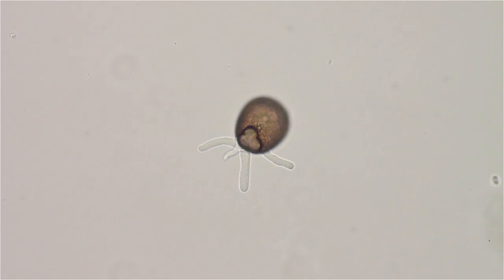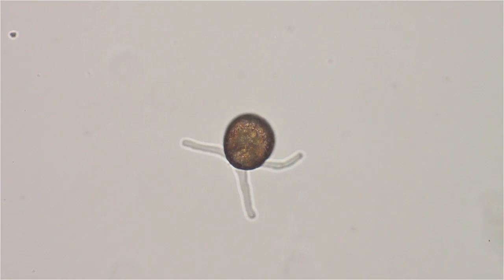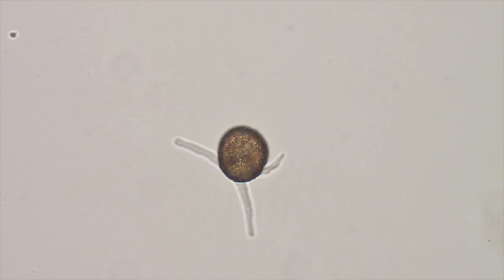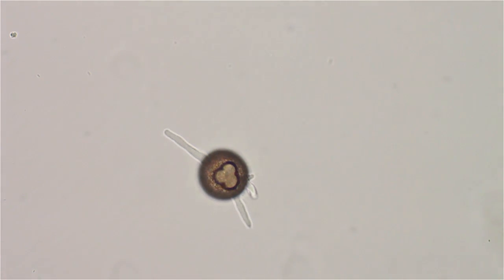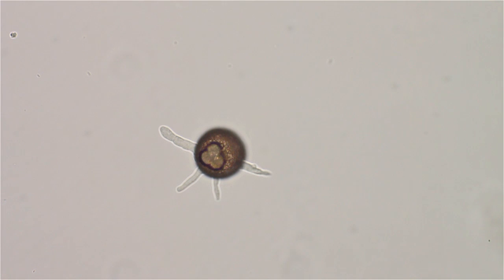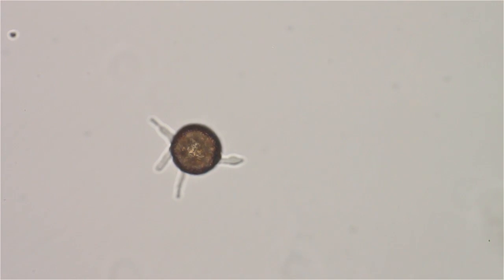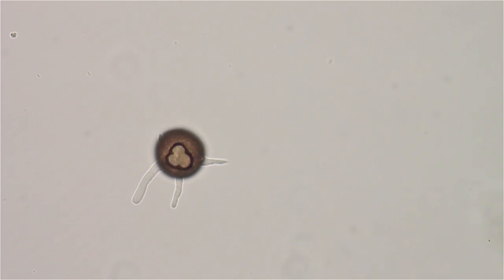It's also more active. Look at that shell — the sand particles glued together with silicic acid he makes inside as a glue. I don't understand the three-leaf clover we're looking at here. It seems to be on the top, kind of like a Fabergé egg, where you can look inside and see what's going on in there. The pseudopods are coming out another hole at the bottom.